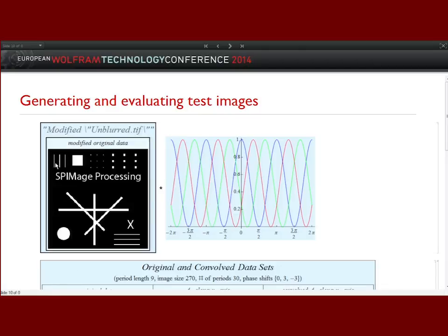So originally, all these 3 lines have exactly the same thickness, and also down here they have exactly the same thickness. So this is an image that I calculated to make absolutely sure that everything is pixel exact, but as you know, there's a mismatch between the resolution that we have here and the resolution with which we display it.